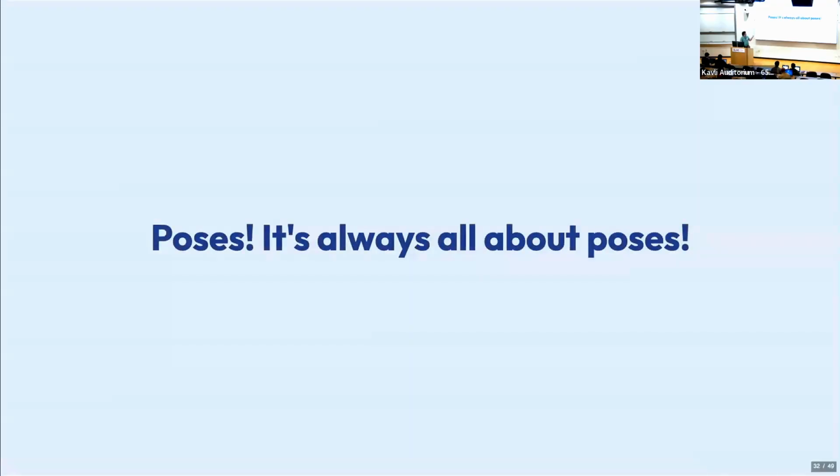But just remember, it's always about poses. I said during the fundamentals part that I think the poses of your particles are the most important thing. This is the thing you should always be thinking about, because it's the hardest thing for us to figure out. All of these refinements, all of this stuff, even the classification, you could think about as getting a group that will have similar poses relative to some volume. It's always about the poses, so it's good to always think about them.